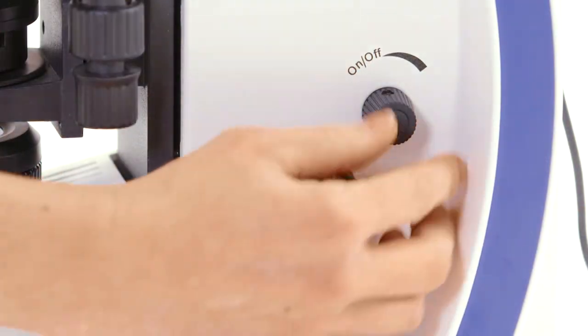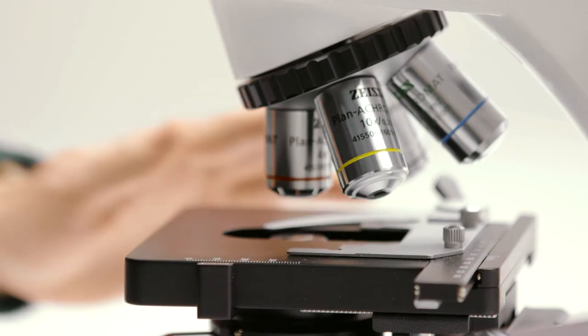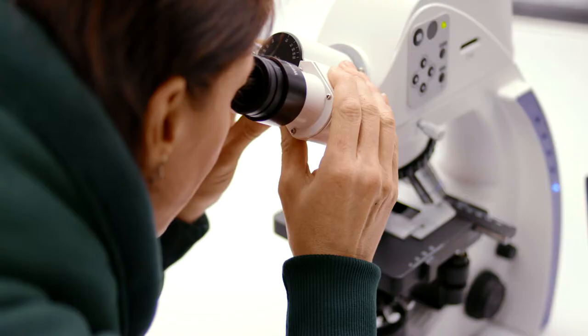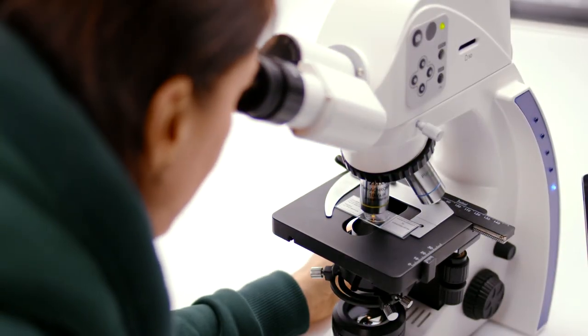Here's how it works. Switch on your microscope, place your slide onto the stage and focus your sample through the eyepieces.